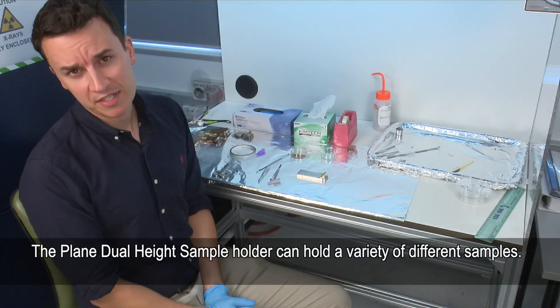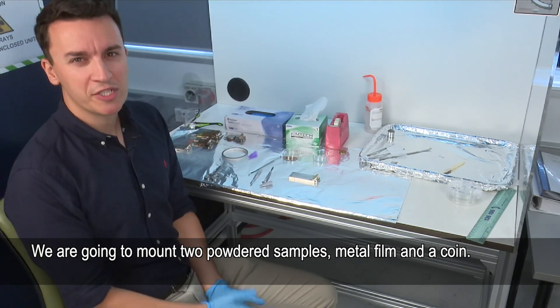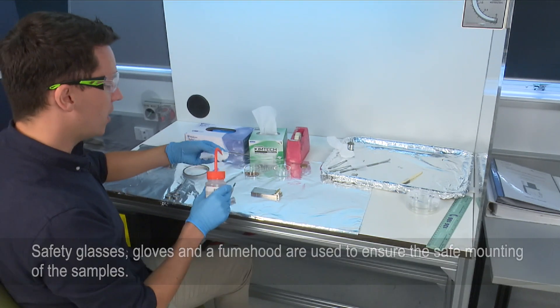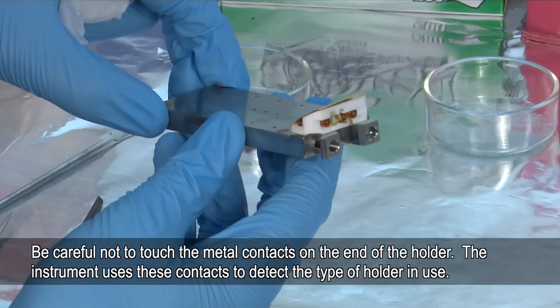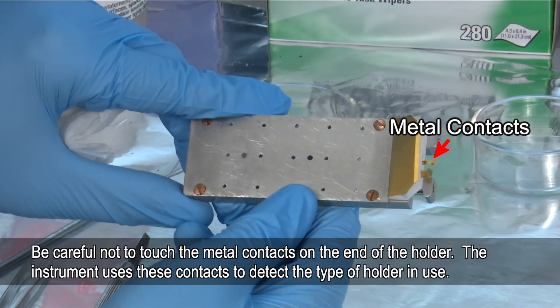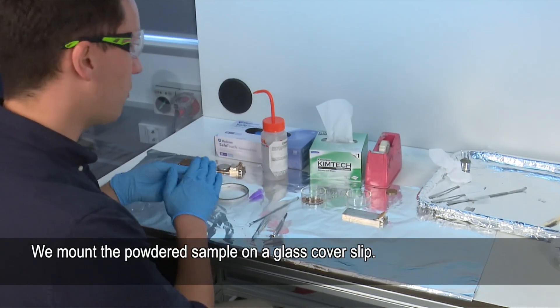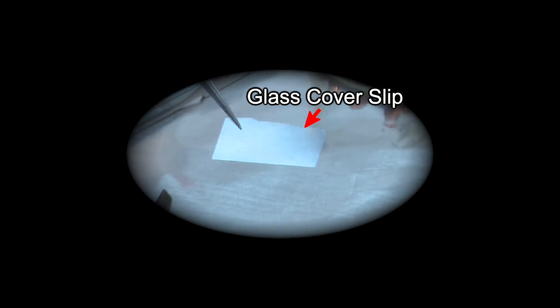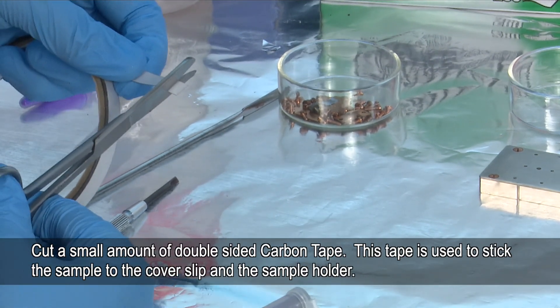Now I'm going to prepare a variety of different samples on the plane dual height sample holder. We've got two powder samples, a metal film, and a coin, just to show the variety of samples that can be analysed. First we need to clean the sample holder — it's just good practice. When you hold this sample bar it's very important not to touch the two metal contacts on the end, because these are what the instrument uses to detect what type of sample holder it is. For the powder samples we use glass cover slips. I'm going to cut a very small amount of carbon tape — this is what we adhere the sample to.